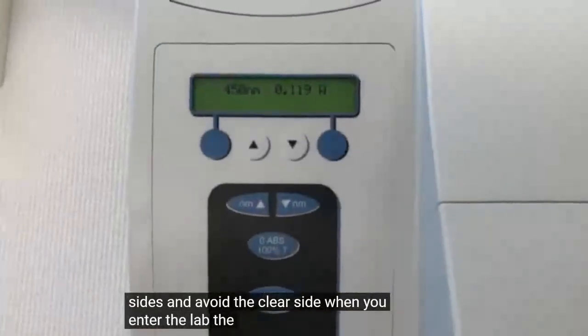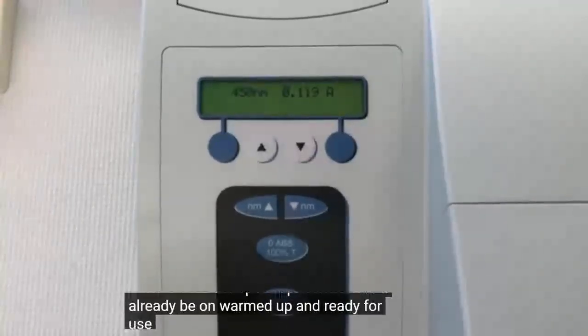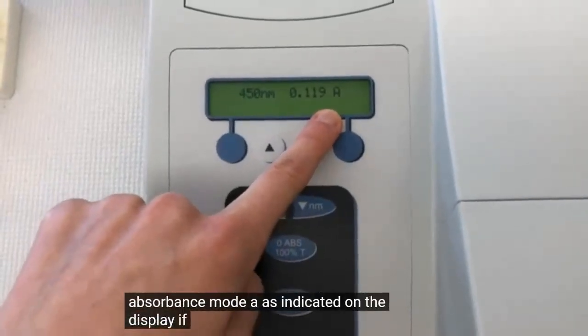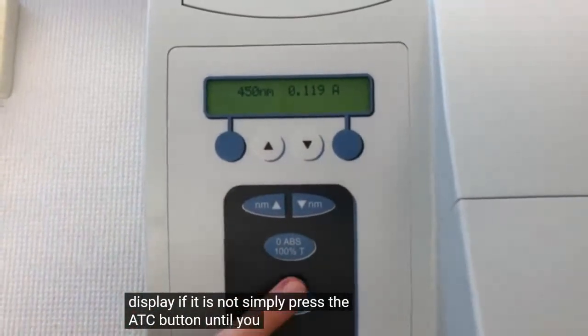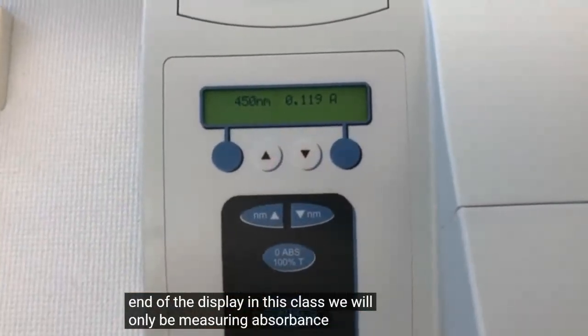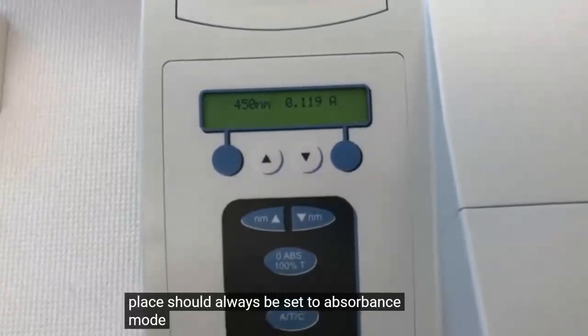When you enter the lab, the spectrophotometer will already be on, warmed up, and ready for use. The display should already be in absorbance mode A, as indicated on the display. If it is not, simply press the ATC button until you see the A at the end of the display. In this class, we will only be measuring absorbance, so the display should always be set to absorbance mode.